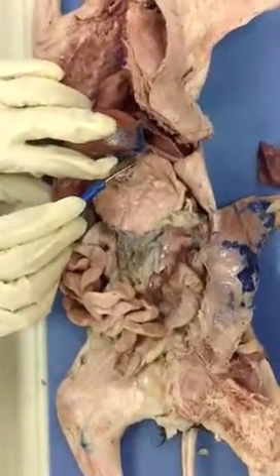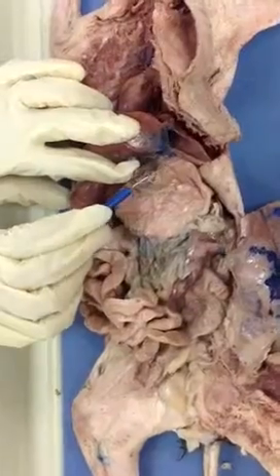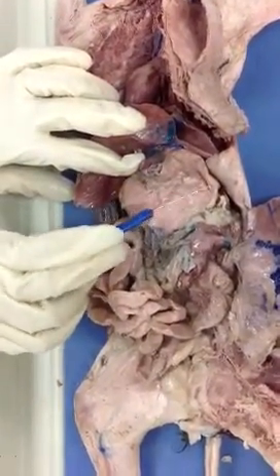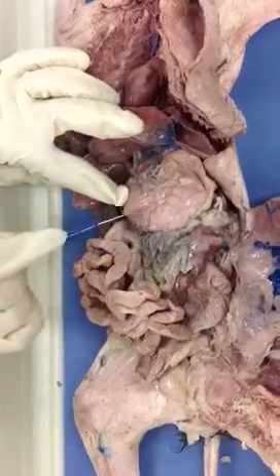We have this dome area here that is called the fundus. This is the body. This is the greater curvature. And this is the lesser curvature.